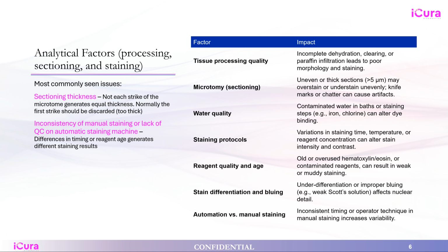Another factor is the inconsistency caused by manual staining or lack of QC on the automatic staining machine. We're not going to get into too much detail on that because it's quite easy to understand.